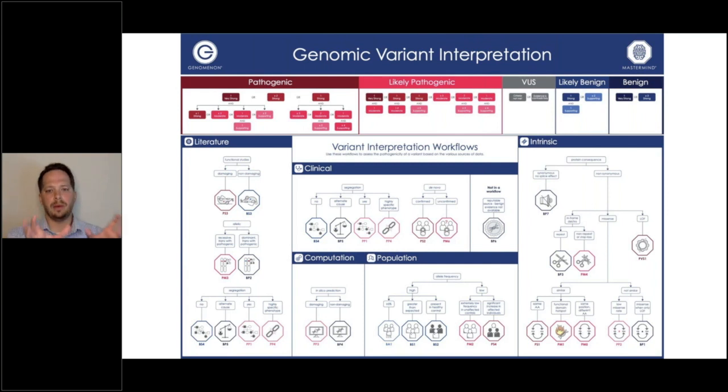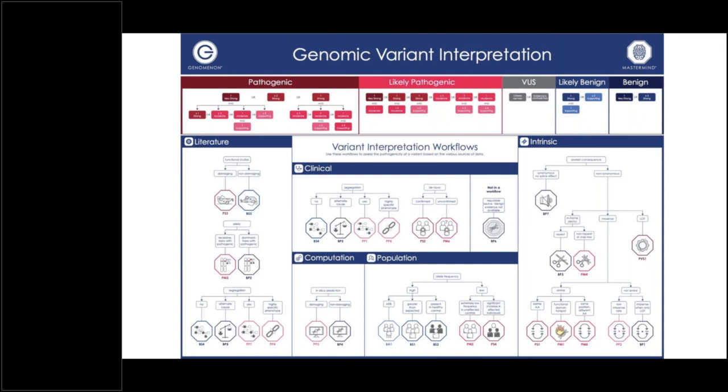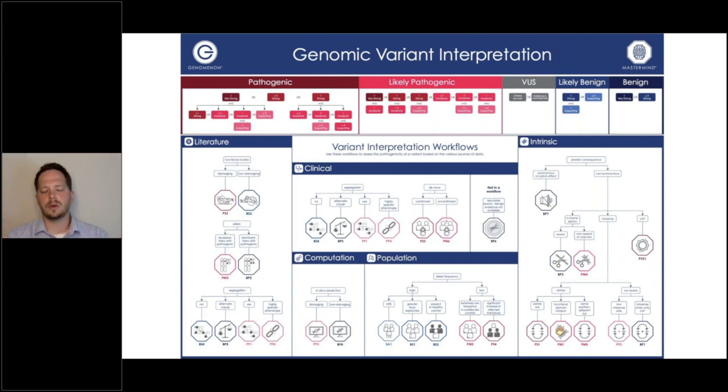Those are databases that are quite likely to be already intercalated into your workflow and data annotation streams. And so those two of the three aspects of the extrinsic evidence have been routinized in most or all labs that do this work.